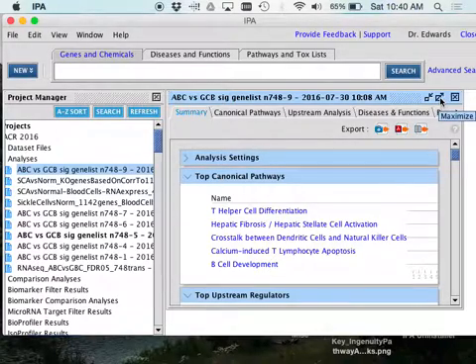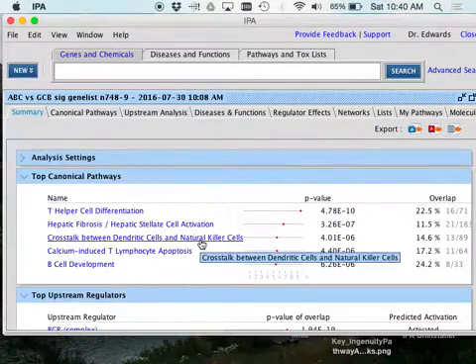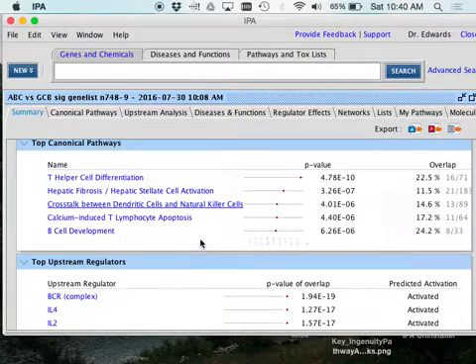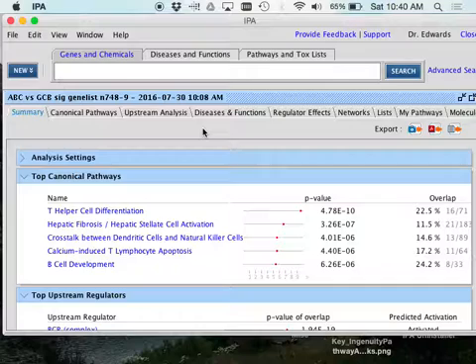Okay, so let me open this up. This first window is basically your greatest hits of your gene list. When I teach this to high school kids, this is how I frame it: activated B-cell lymphomas are a crime. We did some investigation. We got a bunch of people that were around the crime when it occurred. We now have 748 suspects. You are the investigator. How do you determine who is guilty?